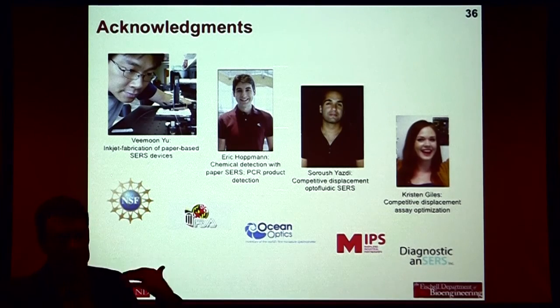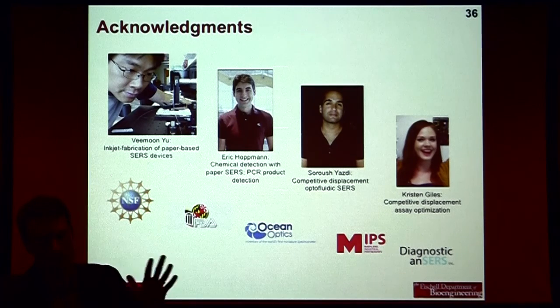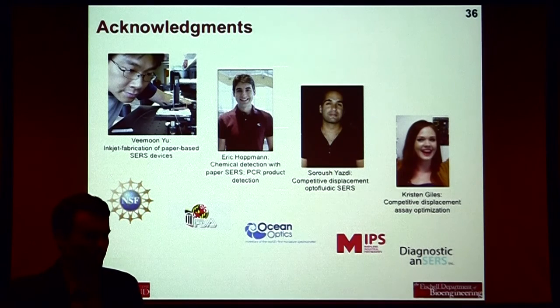So now we've got an argument as to why our sensor is better. It performs as well, but look at how easy it is to get the sample to the sensor, and that becomes a very powerful argument. So consider, that's been my biggest philosophy since getting here, is consider the whole system. It's too bad Mark Austin and John Barris are not here. They would have given you some additional comments.